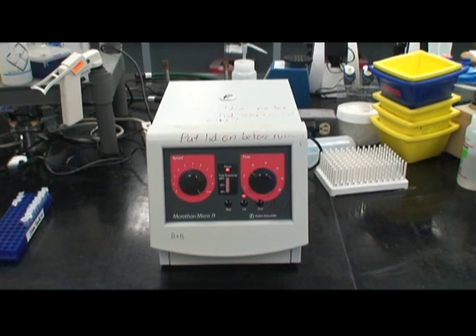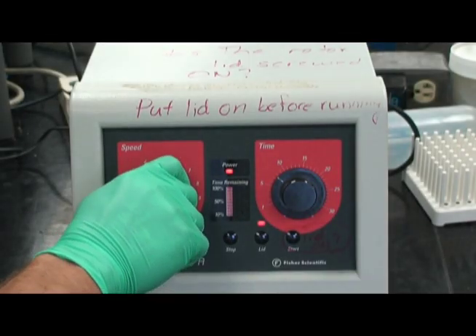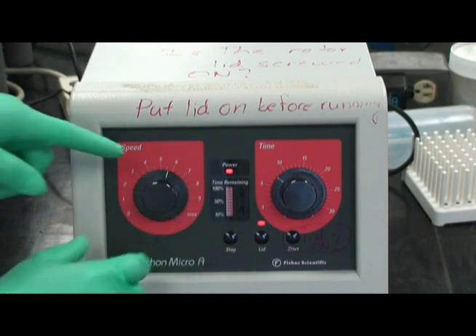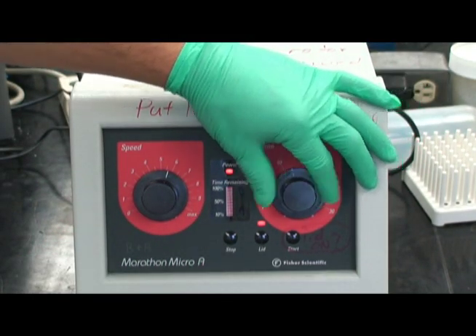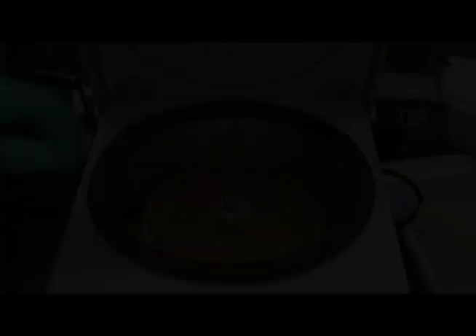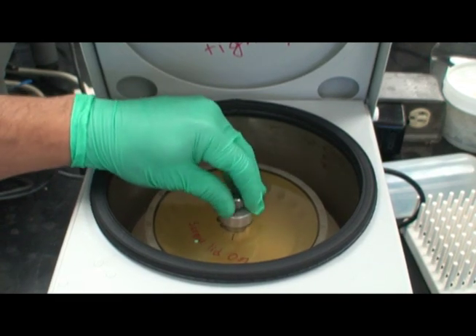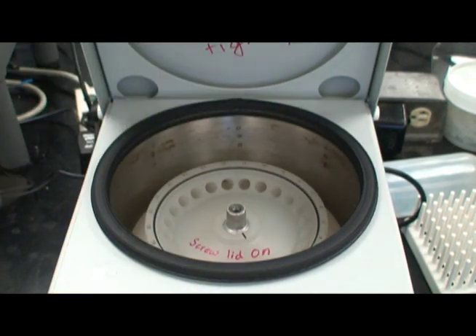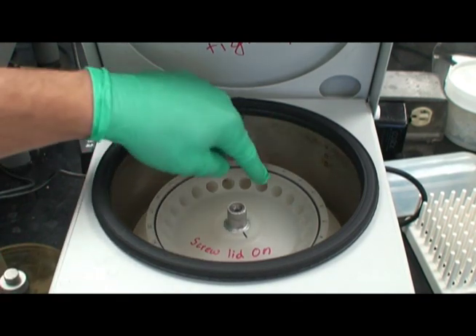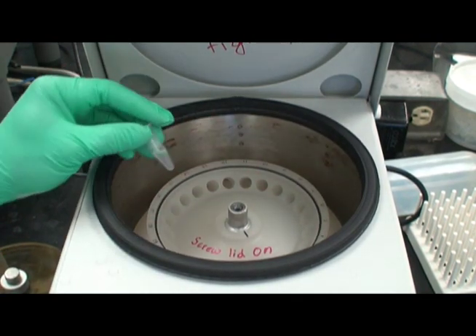This is another microfuge device. As you can see, the speed and time can be adjusted. After unscrewing the safety lid, it is possible to insert tubes into the slots. Once again, they are numbered for easy counterbalancing.